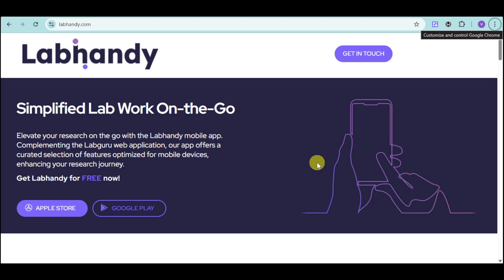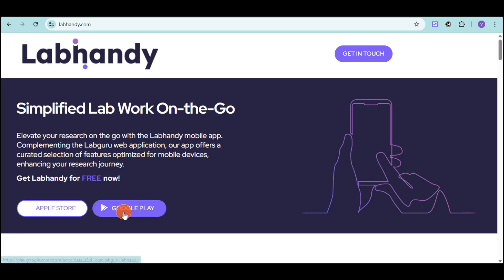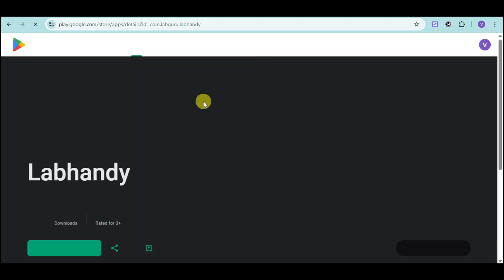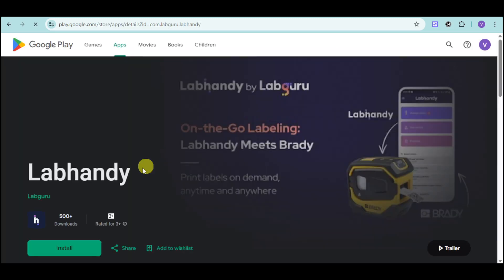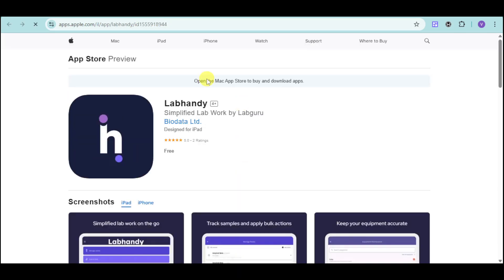What's great with LabGuru that other apps don't have is that they have a mobile app for this. You can get it from your Apple Store as well as your Google Play. Let's see what it actually looks like. Here's LabHandy, which is an app of LabGuru on Google Play Store, and this is LabHandy on the Apple App Store.